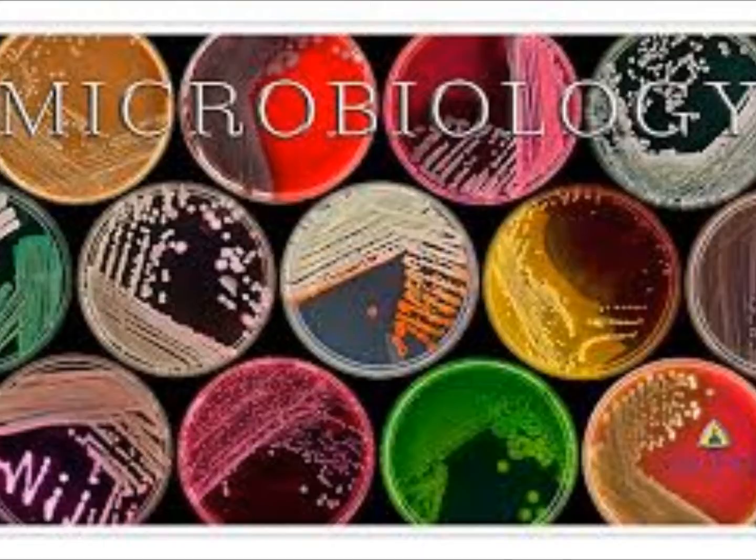And in these characteristics, we're looking at size, shape, margin, elevation, pigment, surface, optical property of a colony. We're looking at those things, but we don't record every one of those, or you wouldn't have enough room on your worksheet. So you're going to pick the outstanding characteristics. And if there's nothing outstanding, then generally you do hemolysis, size, color, maybe the shape, and that's your identifying characteristics.